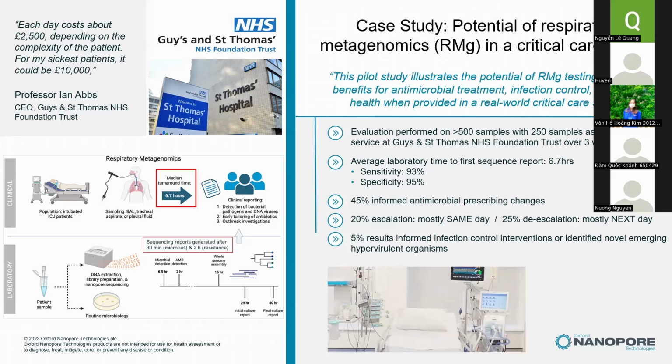And the last question from Huy, he's asking, can ONT real-time analysis capability be applied to AMR detection for rapid point of care testing? If so, what are the main limitations? I think definitely yes. But of course, it depends on your definition of rapid point of care testing. Are you saying 45 minutes or 30 minutes or one hour?